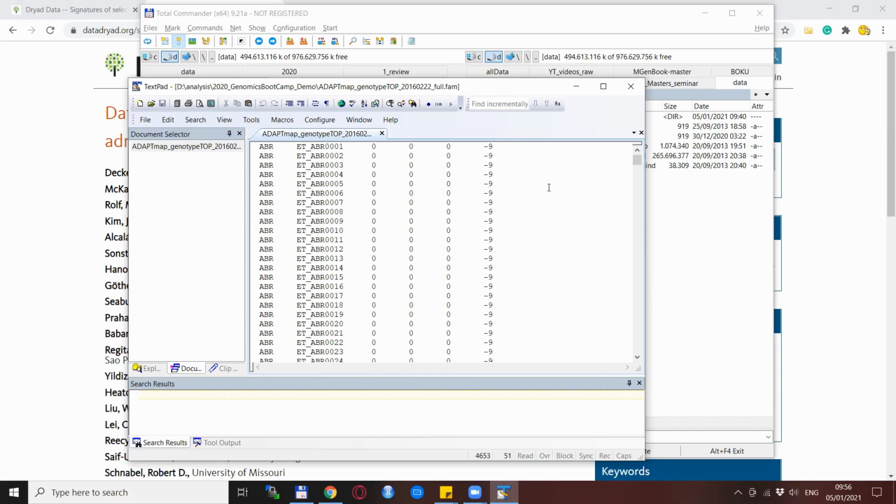The columns themselves also have their meaning, and you can also review this meaning on the Plink website in the help files. But for now, I would just add a few comments on that. So the first column is the so-called family ID that is used for designation of larger groups. So Plink was initially developed for human data, so that's why the terminology is also human related.